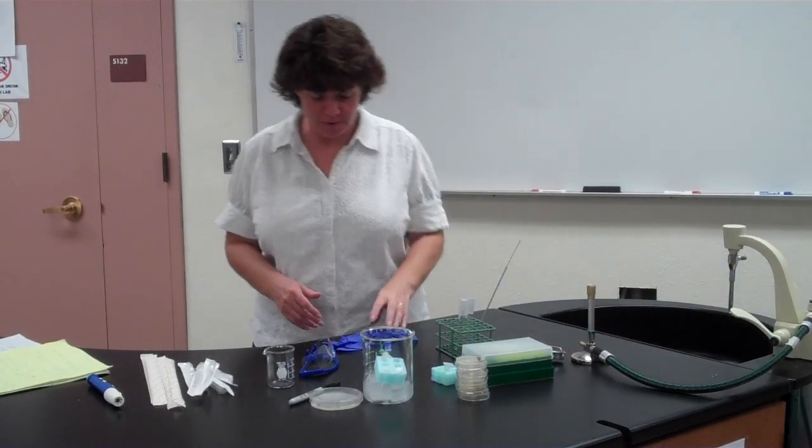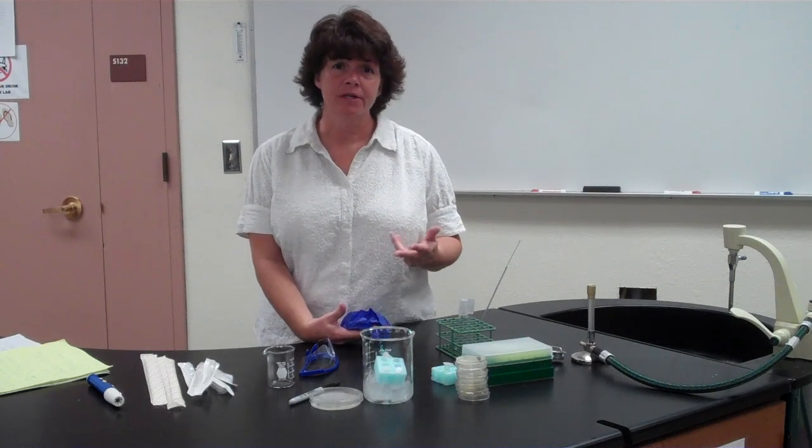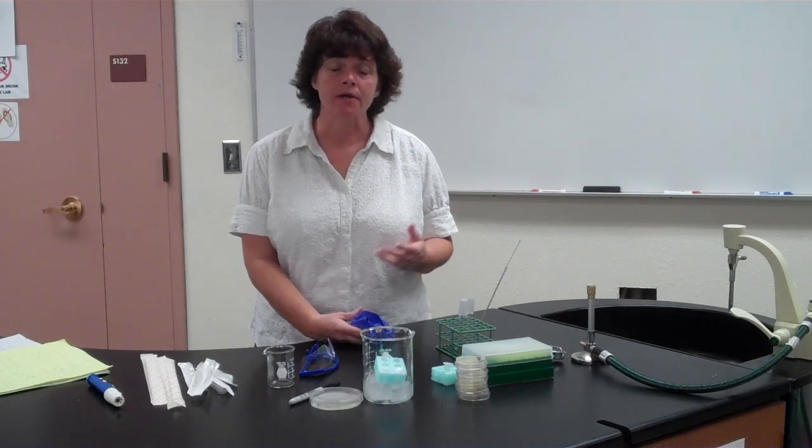Okay, this week you're going to be doing a bacterial transformation. Recall in class we were talking about the different types of genetic recombination that can occur naturally with bacteria cells, but also can be done in a laboratory. We talked about transduction, we talked about conjugation and transformation. So you're going to be doing transformation.